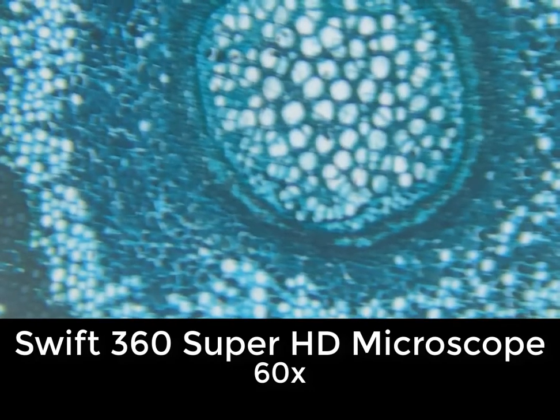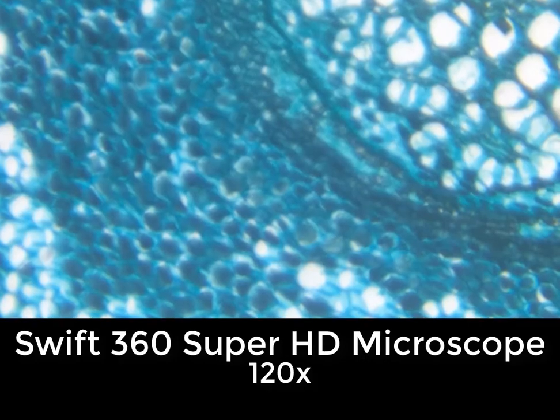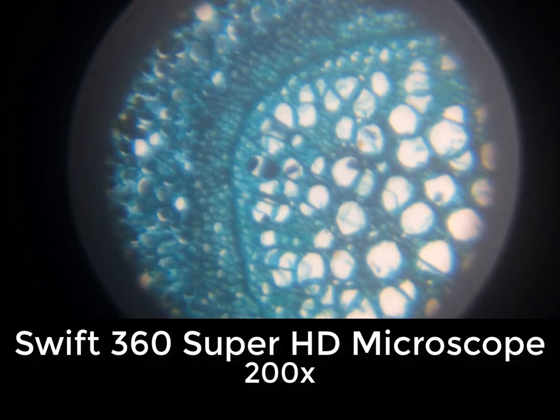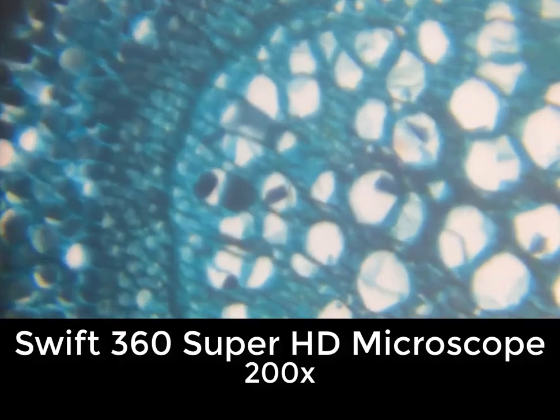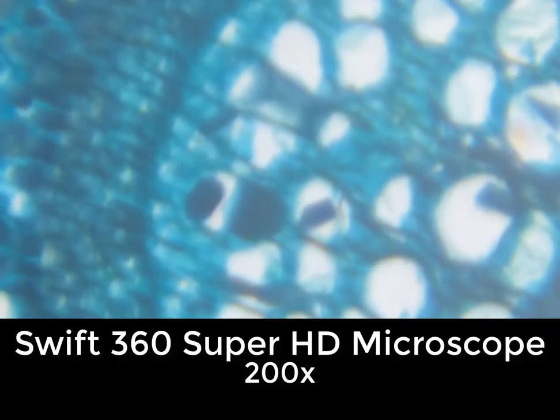Here we see the slide at 60 power and at 120 power. We can move to the 200 power, and then we'll see how we can zoom in and out with our finger using the smartphone. Here we are at 200 power — that's all the way out. That's good for positioning, but when we want to look closer, we can use our fingers to zoom in.